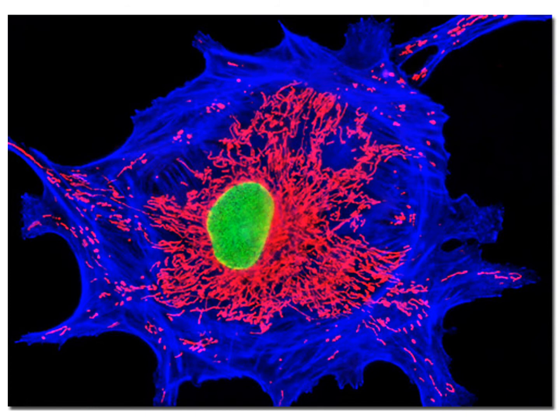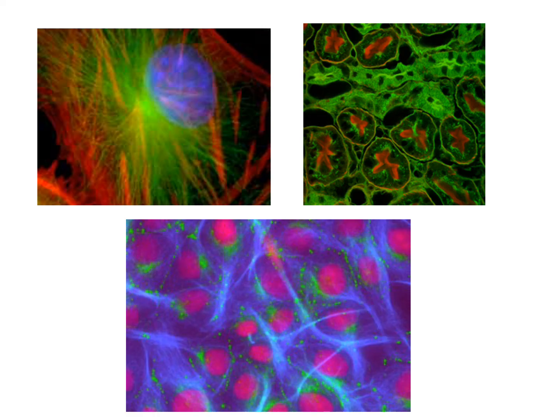And this is really helpful in medicine because, like in this example, we can fluoresce the nucleus, or we can fluoresce the microtubules, or we could fluoresce something like breast cancer cells. Fluorescence microscopy makes diagnosis of a microscopic specimen super easy because it'll just glow in the dark and it only attaches to certain specific molecules. Here's some more examples of fluorescence. It's just really pretty. I could look at these pretty much all day.